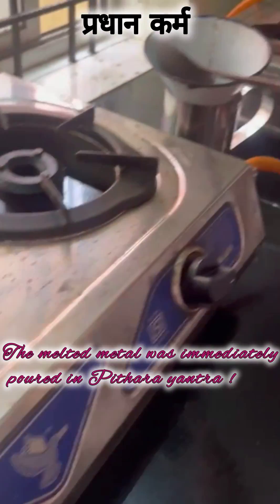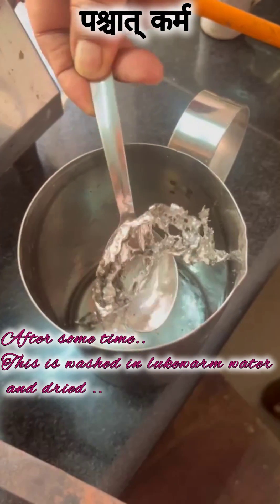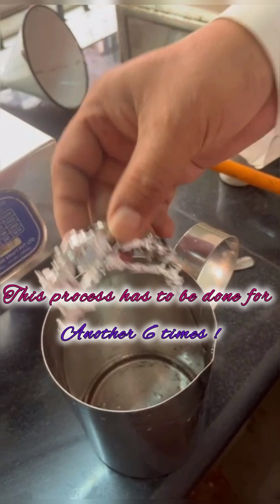Once this dhatu liquefies, it is poured into a peetara yantra. This is left for some time to cool down and collected. This procedure has to be repeated for seven times in total.